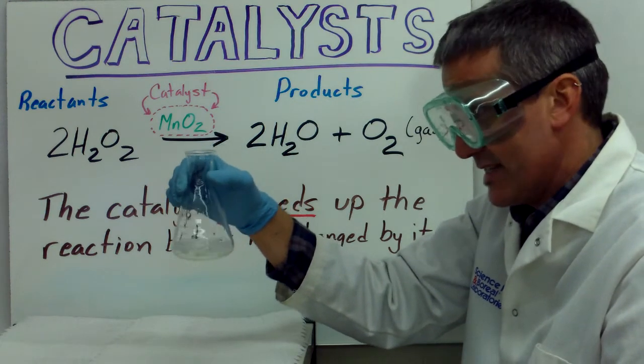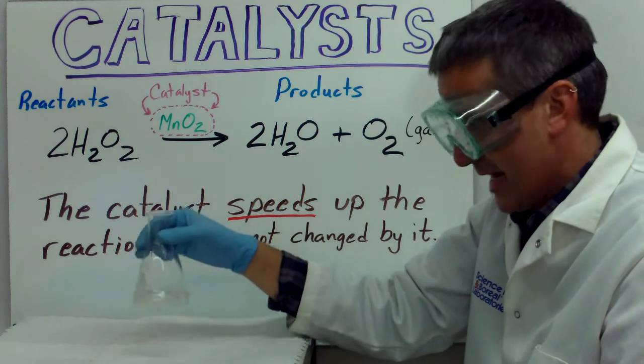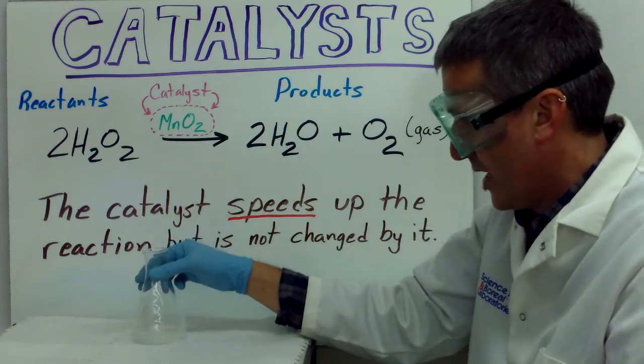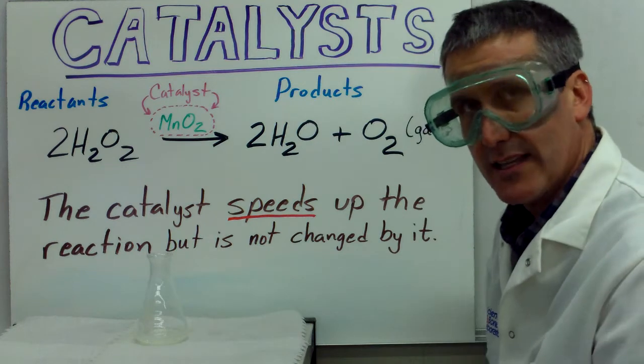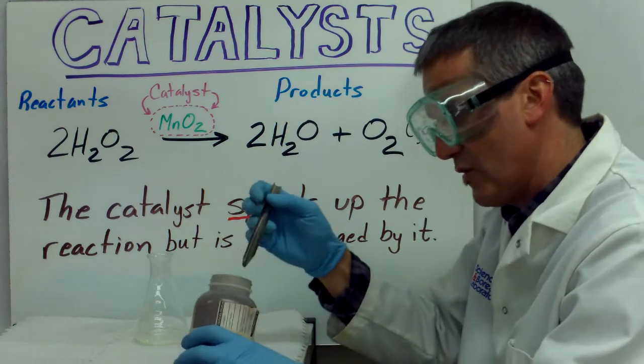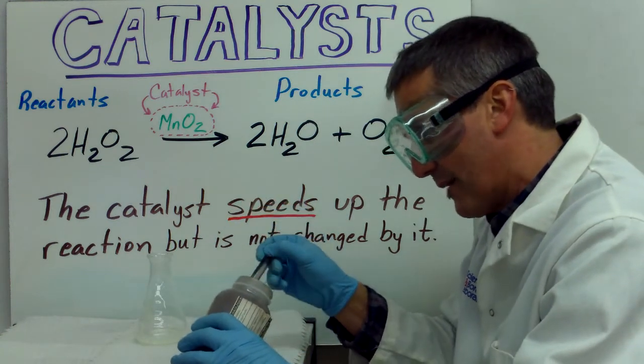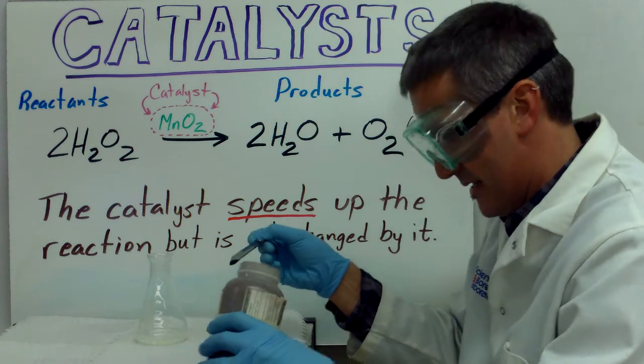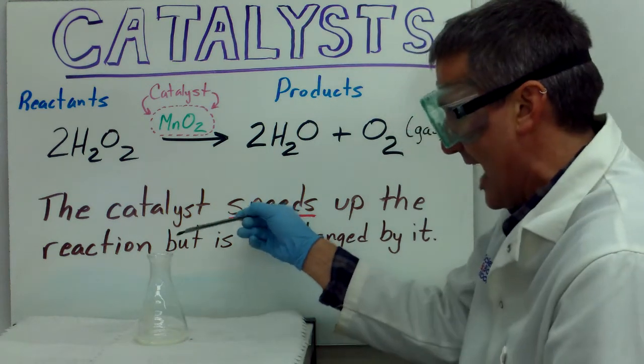The reaction rate is not very fast and not very impressive. But when we add the catalyst, the manganese dioxide, which I'm going to do right now, it's a black powder. I'm going to take a little bit, and I'm going to add it in.